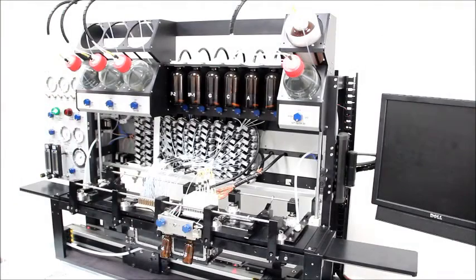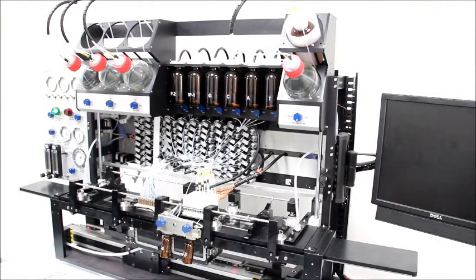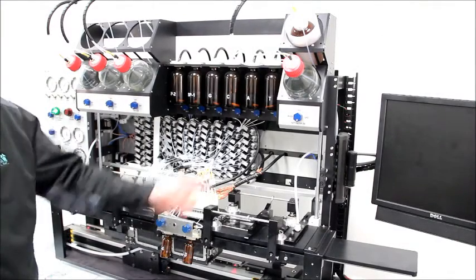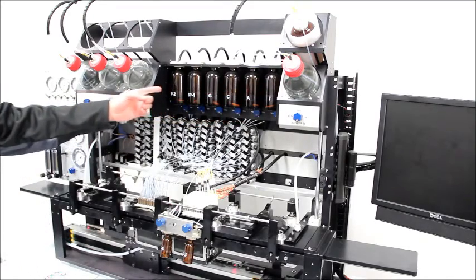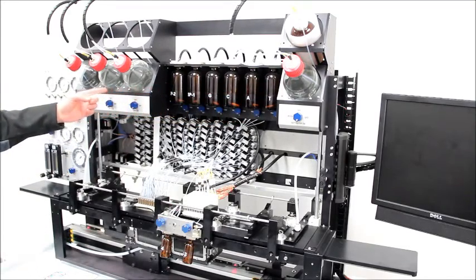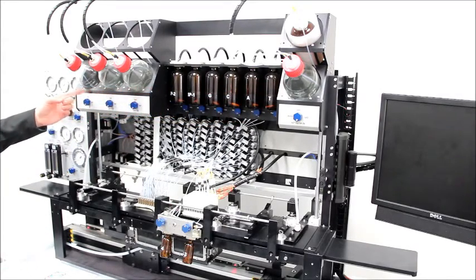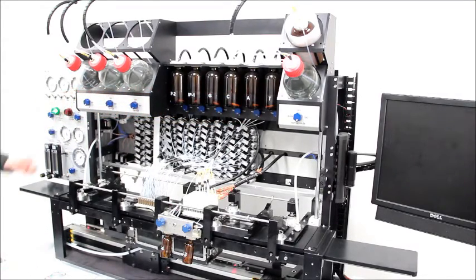The top portion of the instrument contains the smaller reagent bottles for the activator, amidites, capping reagents, and oxidizer.